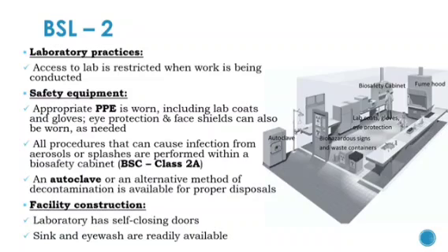Laboratory practices. Access to laboratory is restricted when work is being conducted. Safety equipment. Appropriate PPE is worn, including lab coats and gloves. Eye protection and face shields may also be worn as needed. All procedures that can cause infection from aerosols or splashes are performed within a biosafety cabinet of Class 2A. An autoclave or an alternative method of decontamination is available for proper disposals.